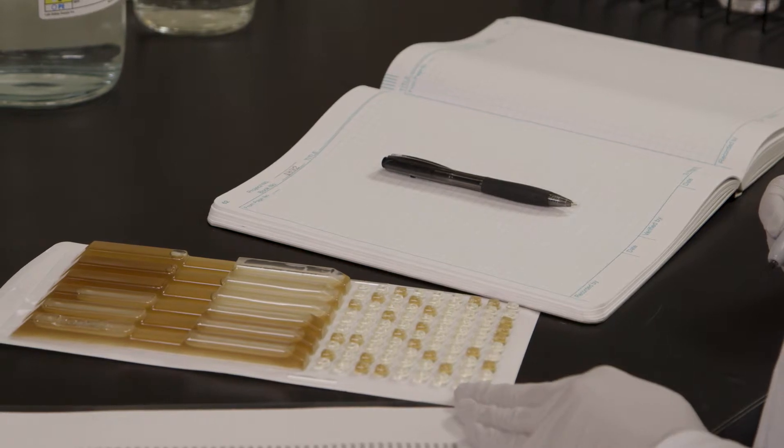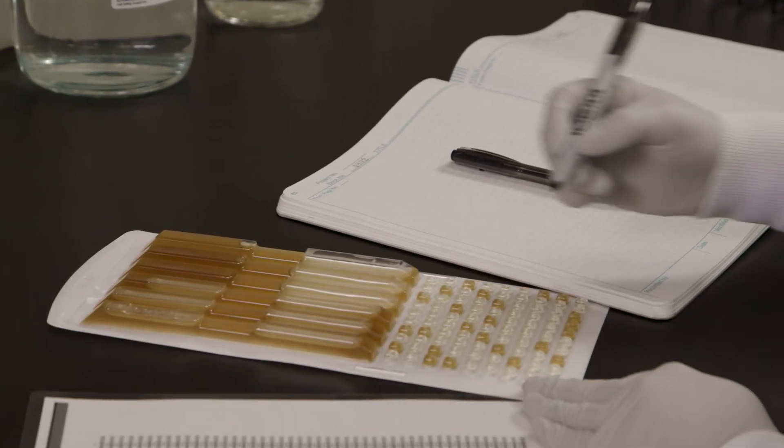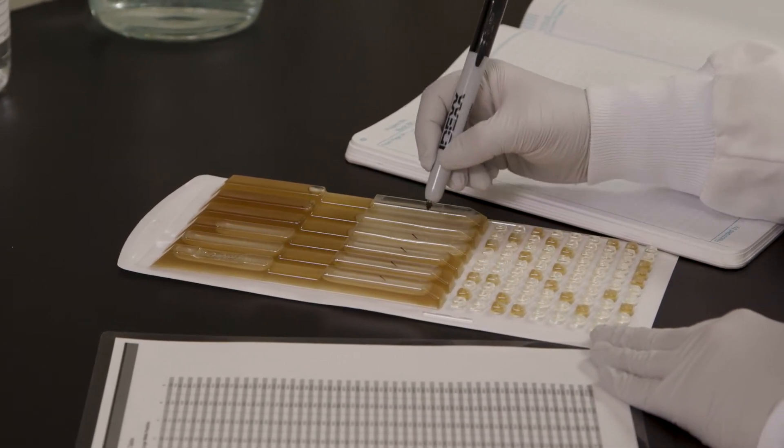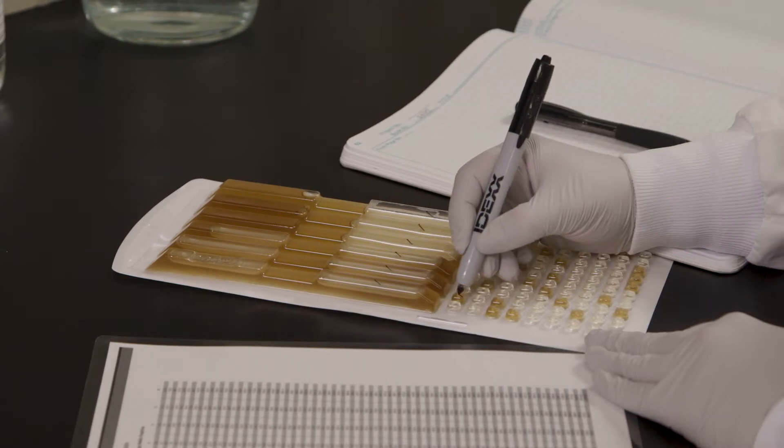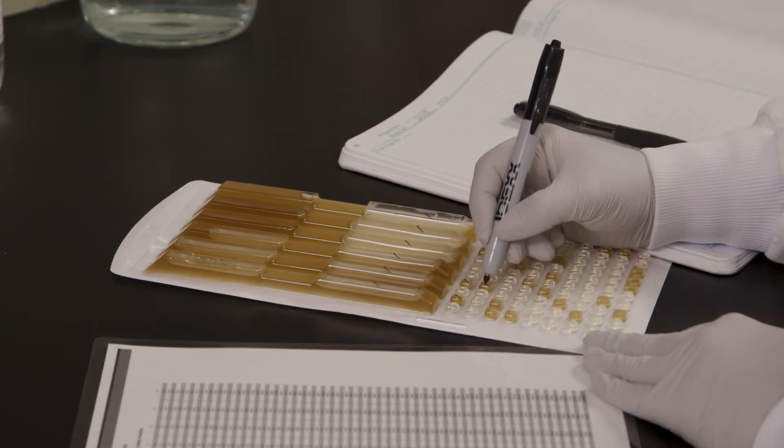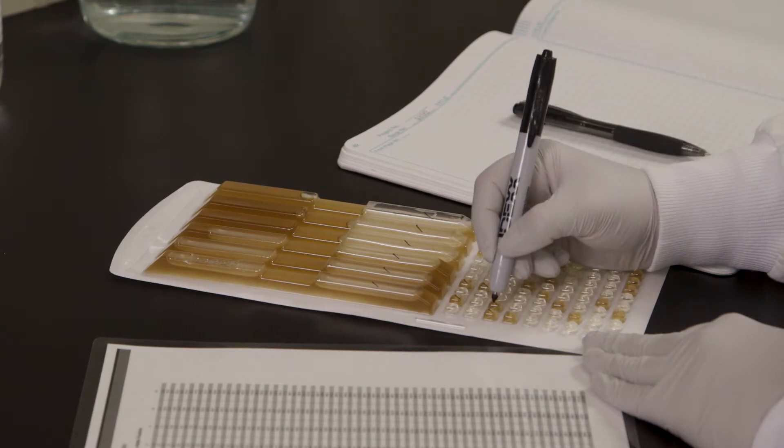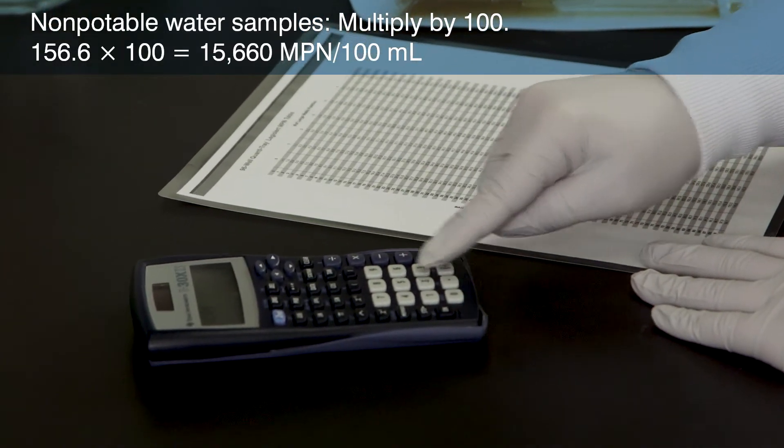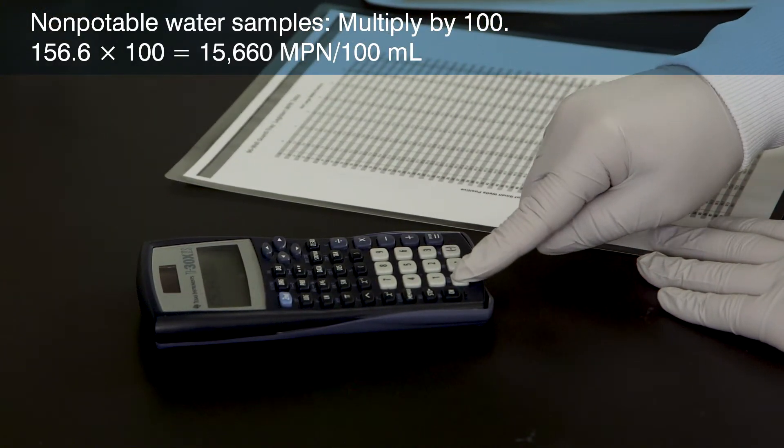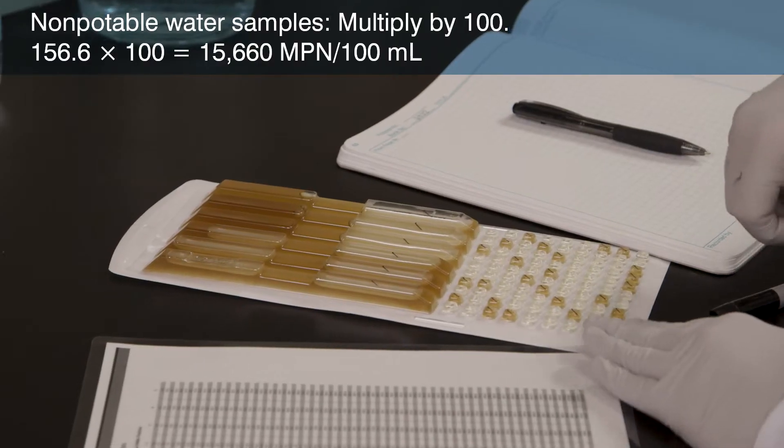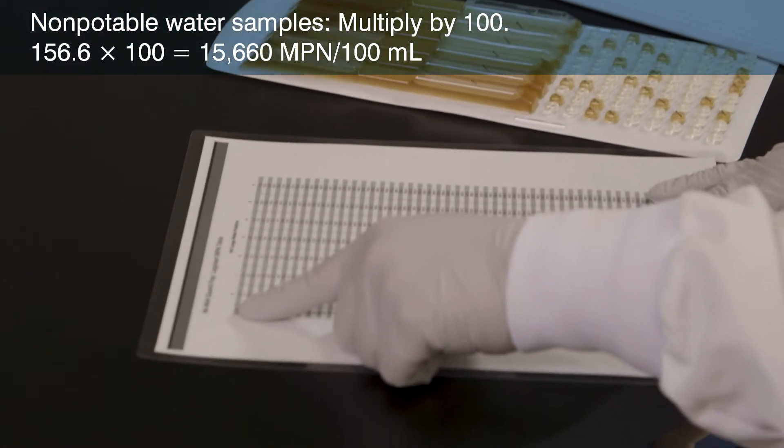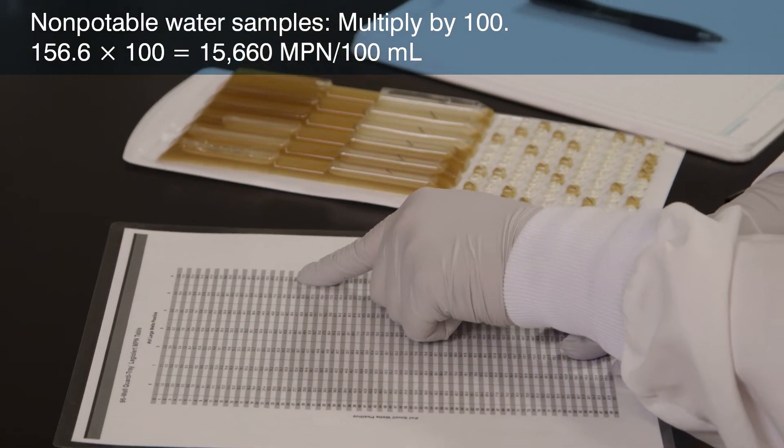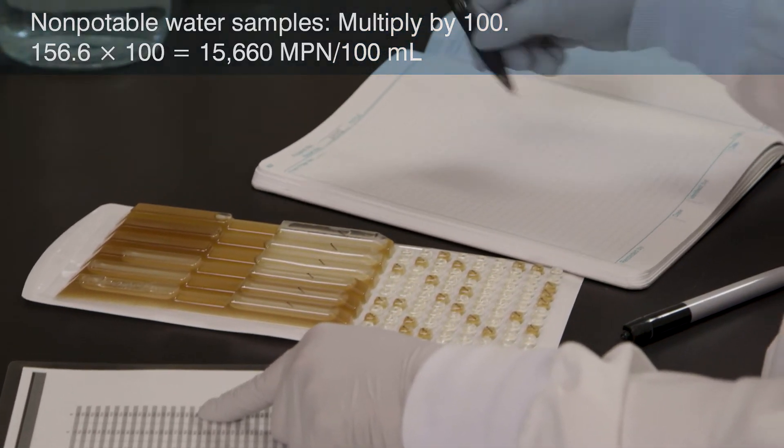After incubation, look for any indication of brown color and or turbidity greater than the negative control which indicates a positive well. Mark each brown or turbid well, count the marked wells and then refer to the MPN table included with the Quantitray LEGALERT trays. To obtain the MPN per 100 mL, remember to multiply the MPN by 100 because you are using 1 mL of the original sample. The most probable number for this non-potable water example is 156.6 multiplied by a dilution factor of 100 to achieve 15,660 per 100 mL.